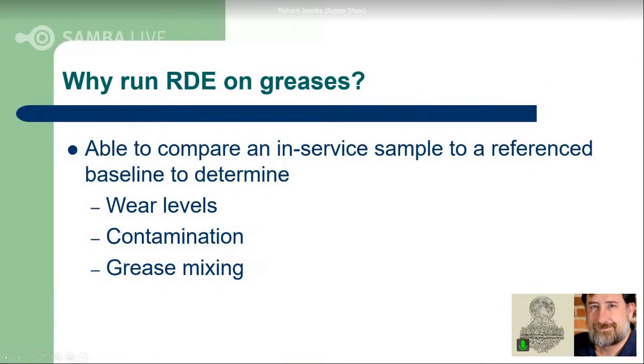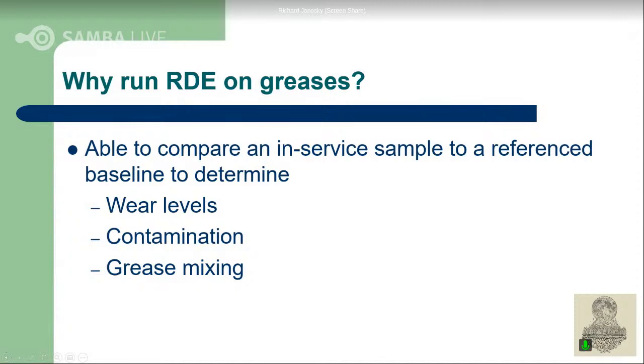So to start off today, why do we run RDE on greases? RDE gives us the ability to compare an in-service sample to a reference baseline grease. And we're getting the value out of this in understanding our wear levels, contamination levels, and the ability to also identify grease mixing if that is happening with that piece of equipment.